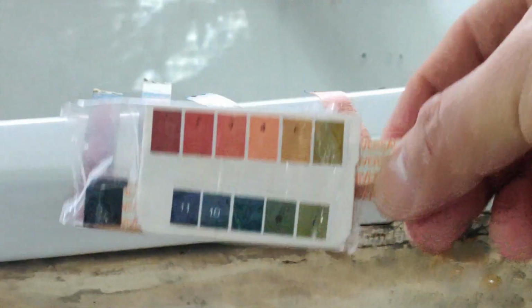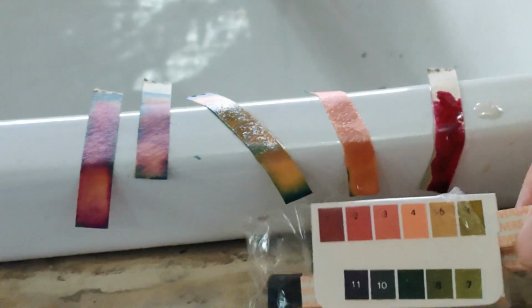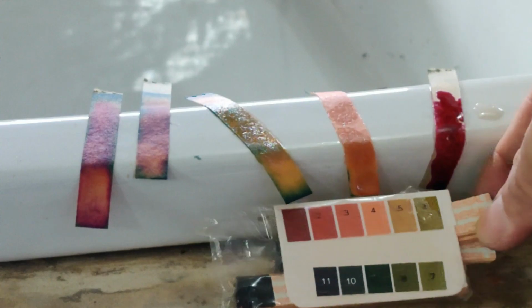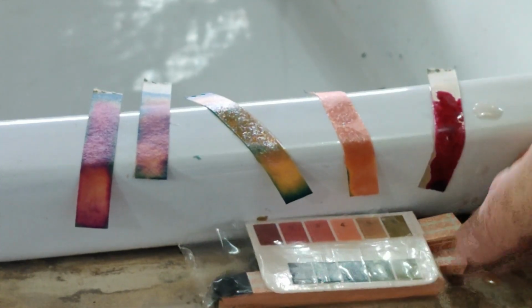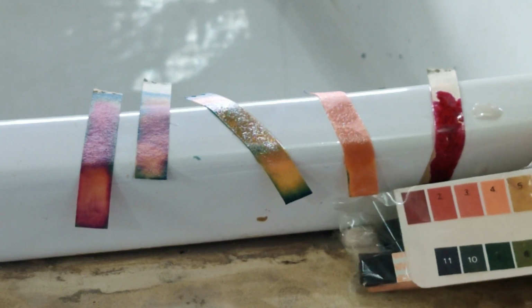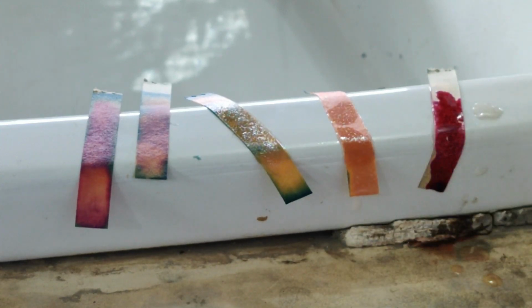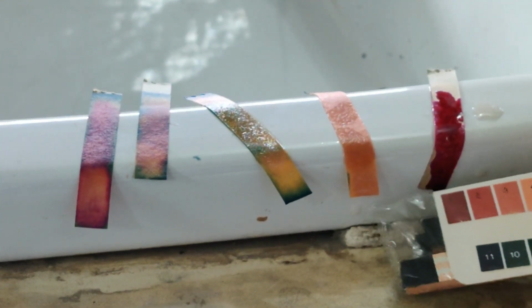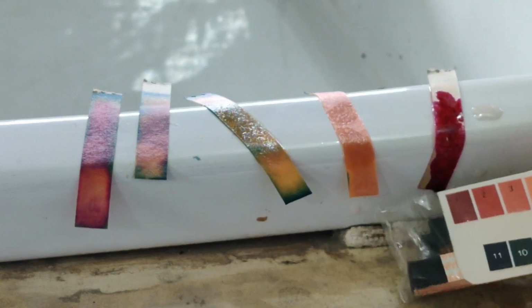So as you match whichever color it is matching with, for example if I want to match here, I think this is what it is matching, you see number 4, and this paper is what is matching, this one I am talking about, just look at that 4, and if you look at this one, then I think it is matching 2. So I think the strongest acid I had used was your concentrated sulfuric acid. Concentrated sulfuric acid, look at this, so this is matching more or less this one. So pH value is 1, means very very strongly acidic.